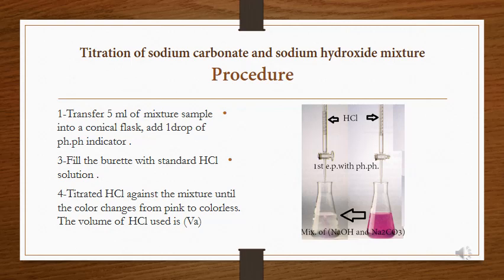We have a mixture of NaOH and Na2CO3 in the conical flask. Add one drop of phenolphthalein indicator — its pH range corresponds to the first endpoint at around pH 8. The HCl is then added from the burette, and we note the volume at the first endpoint (VA).